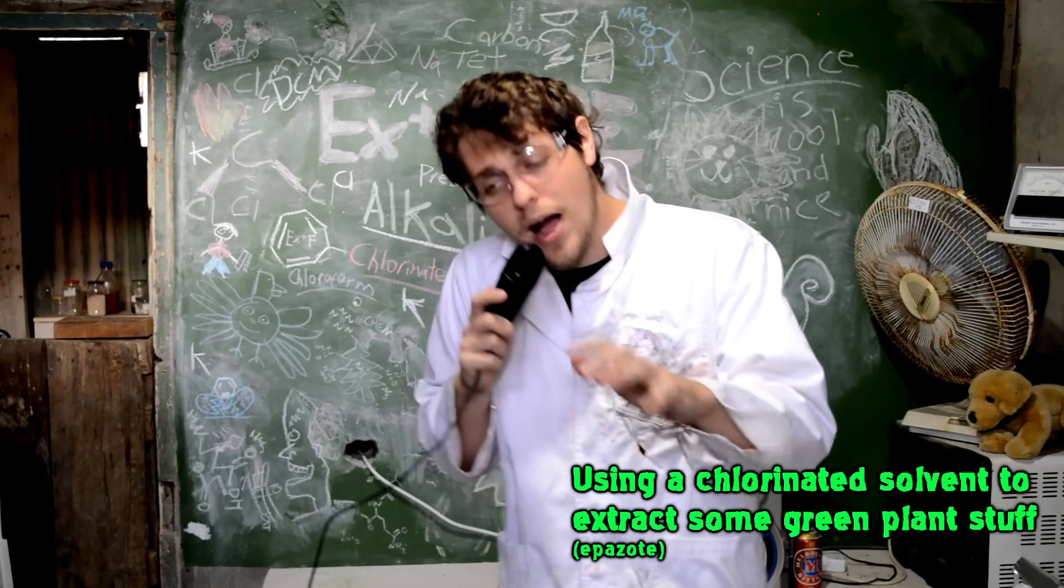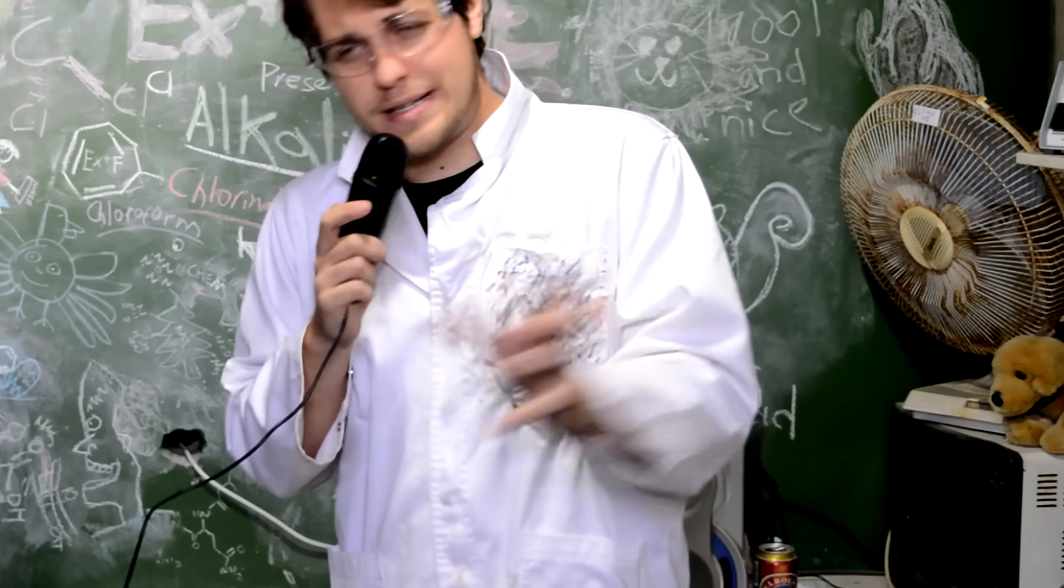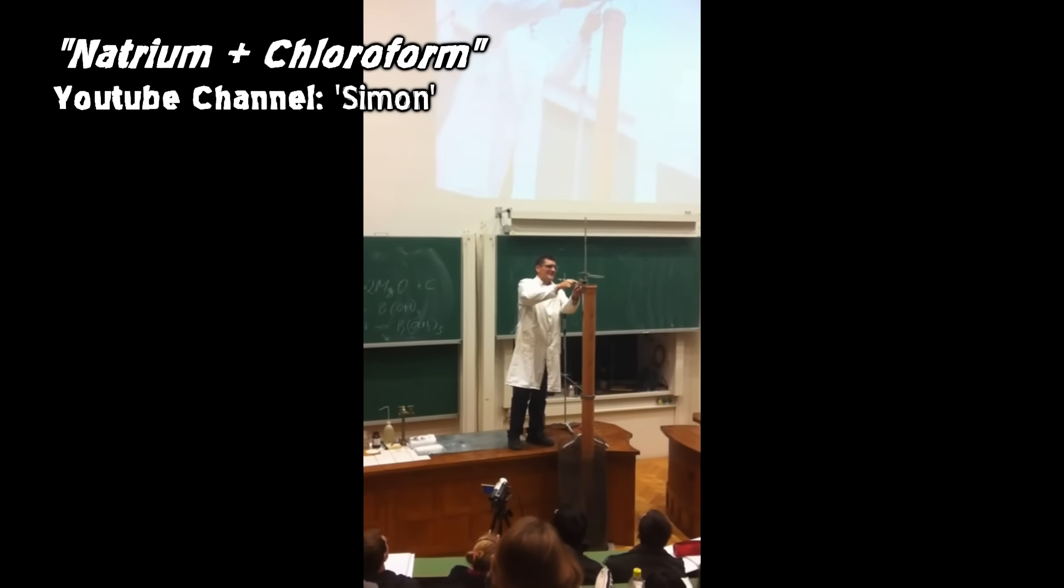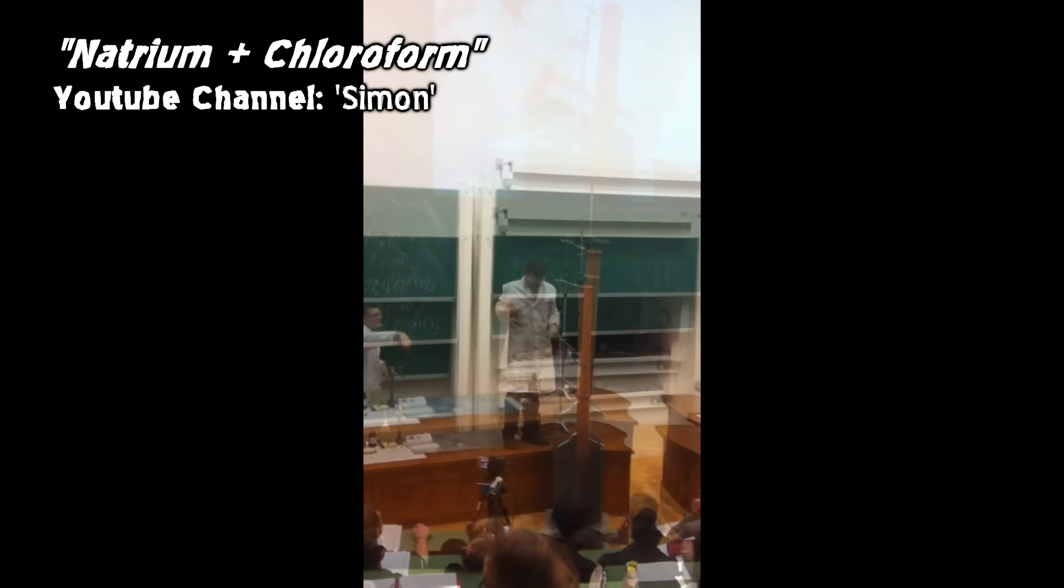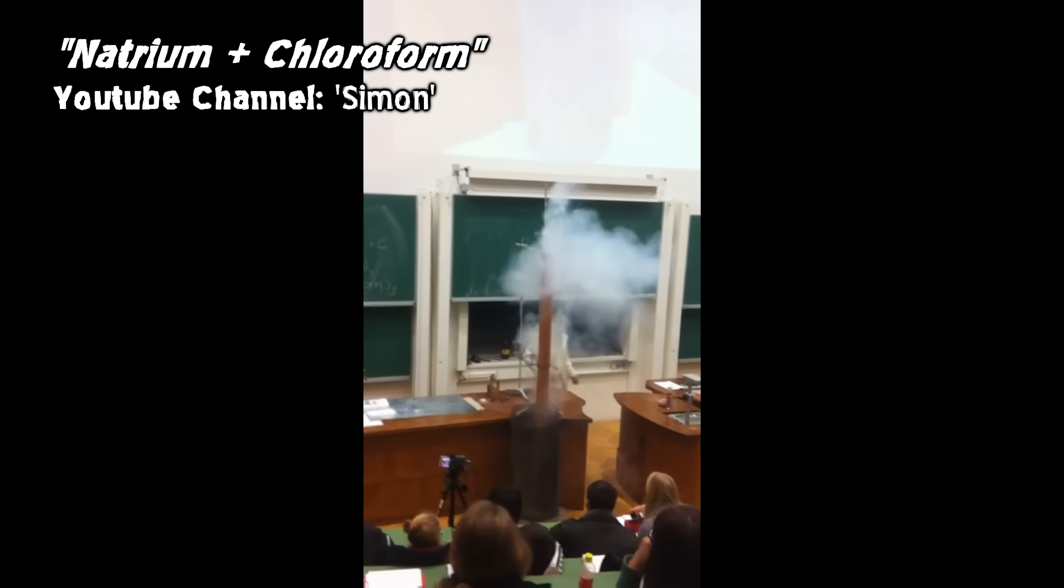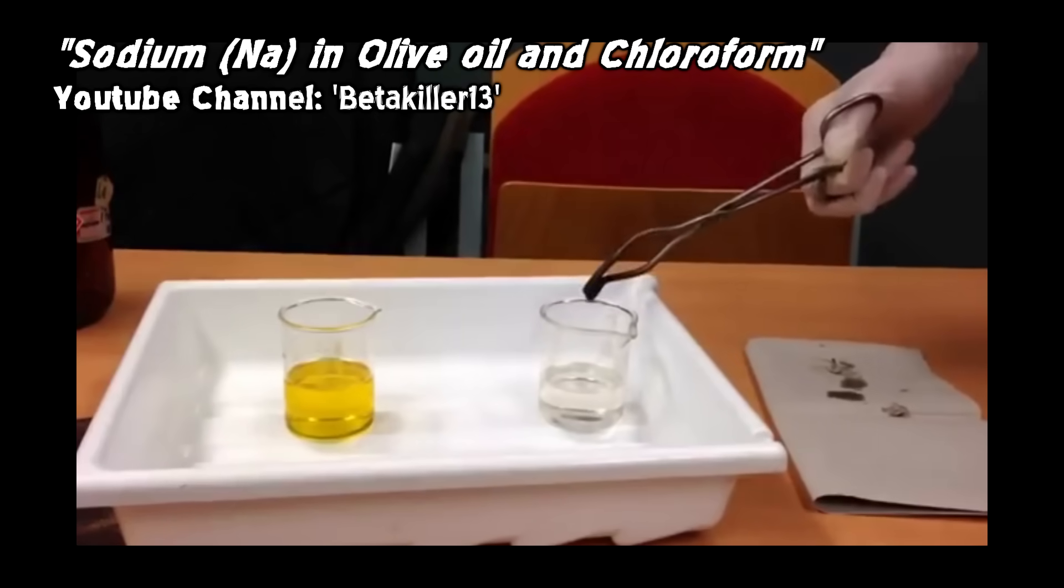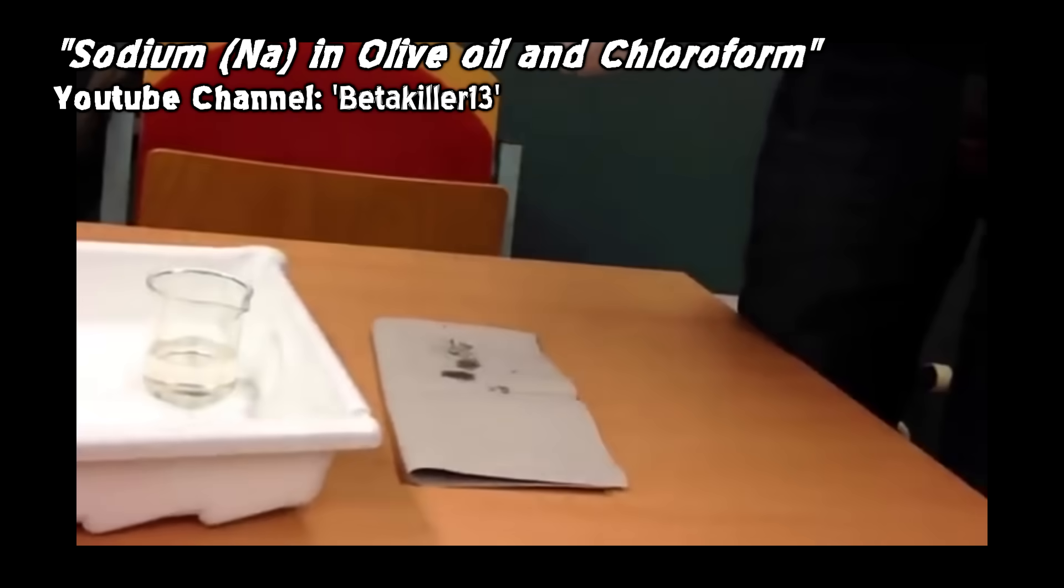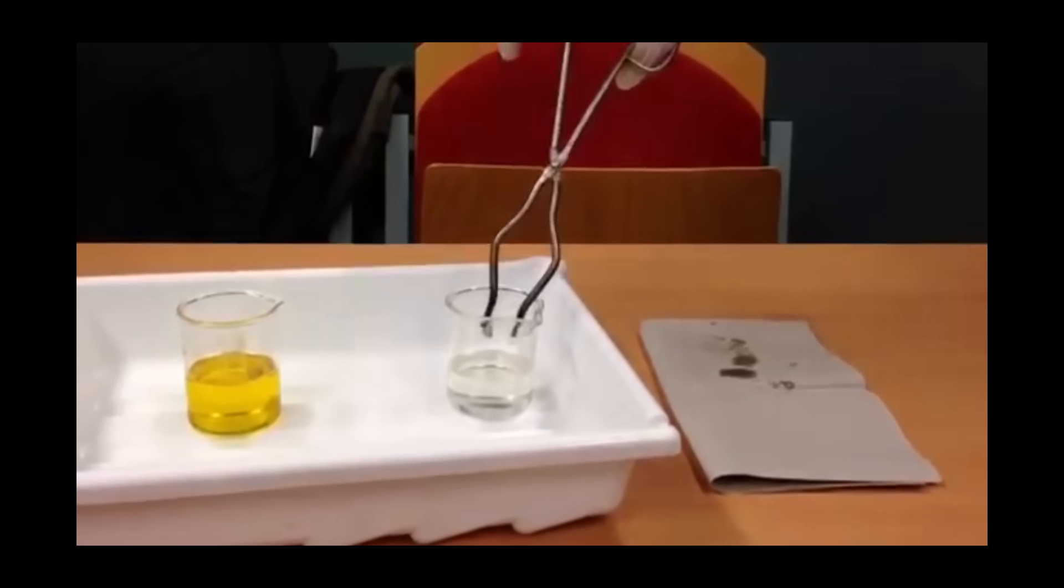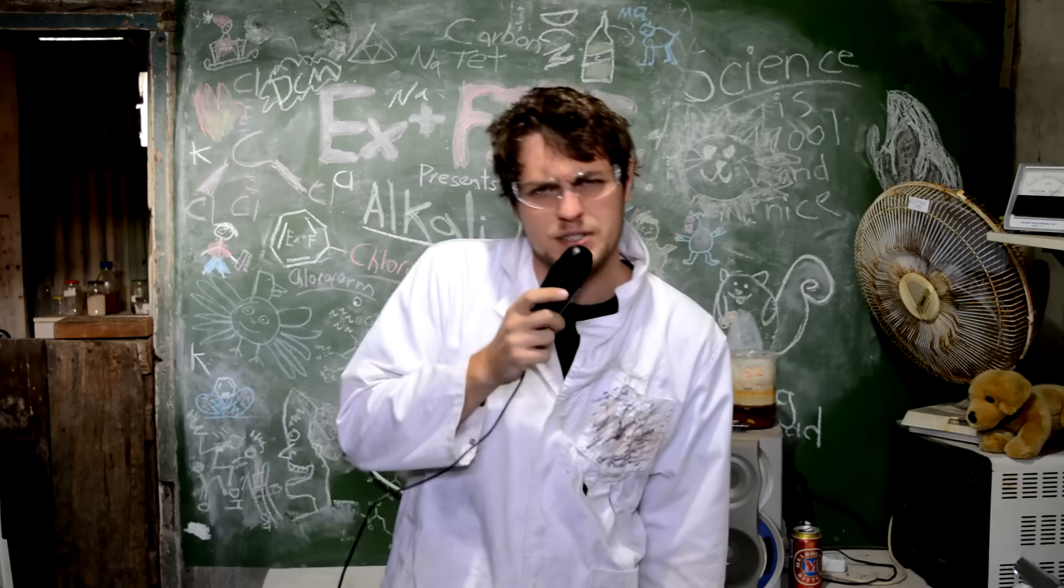To look at examples of what might actually happen, we can go to the font of all chemistry knowledge, YouTube, and look up all examples of alkali metals and chlorinated solvents. And we only come across two. One of which ends in a violent detonation. And one of which just sort of happens. So the question is, which one of these examples is correct? Was this guy split seconds away from disaster?